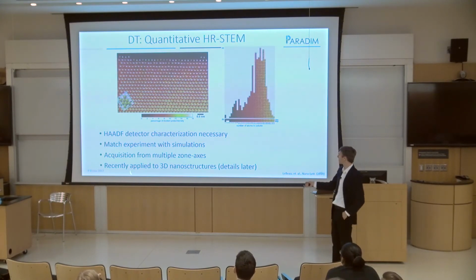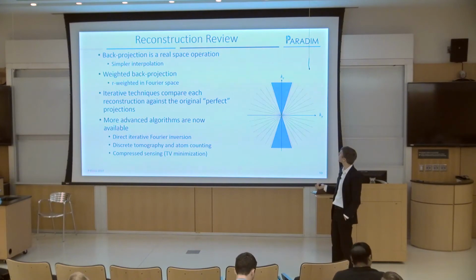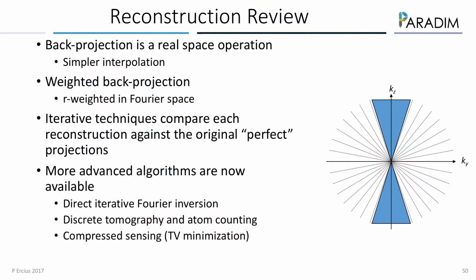Okay? And this was recently applied to 3D nanostructures. This paper only showed how you could count these atoms, and then I'll show a little bit of the details of that. So if we go back a little bit, a reconstruction review.